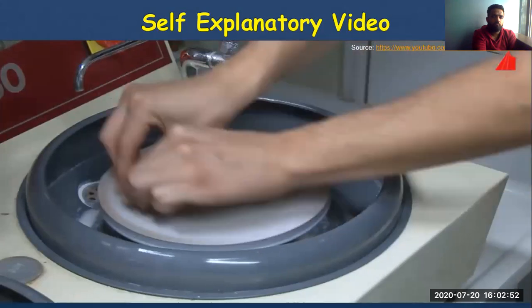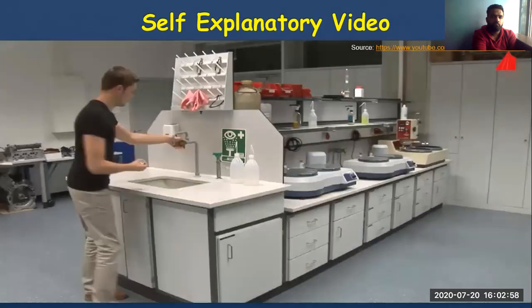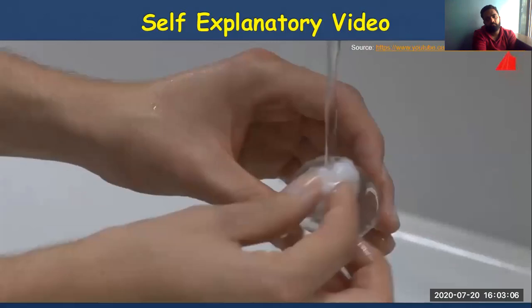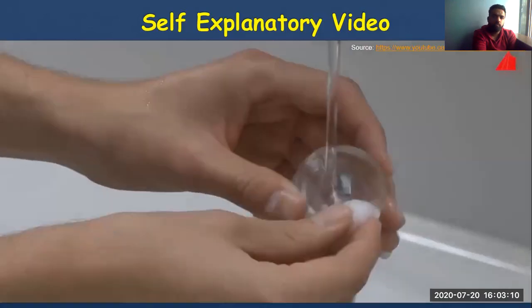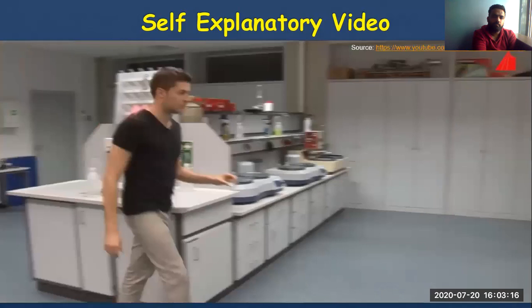At the end of the mechanical preparation, special care has to be taken to clean the specimen properly. On the one hand, all abrasive particles have to be removed. On the other hand, the freshly polished surface must not be scratched or damaged. Under running water, the material tester gently wipes the specimen with cotton wool, thoroughly rinses it with alcohol, and dries it with a hairdryer.